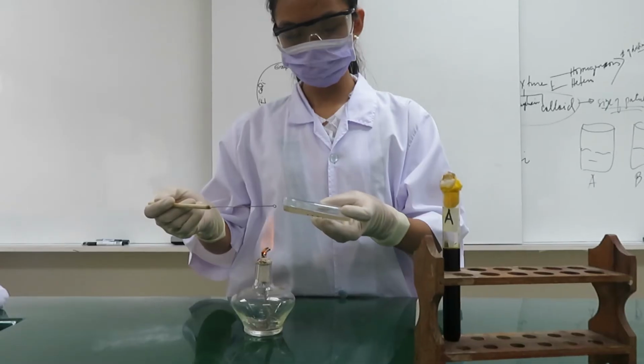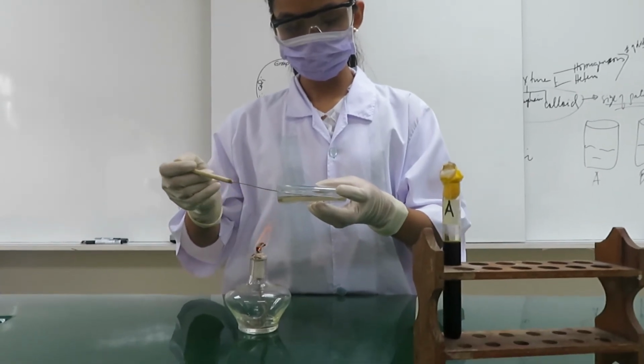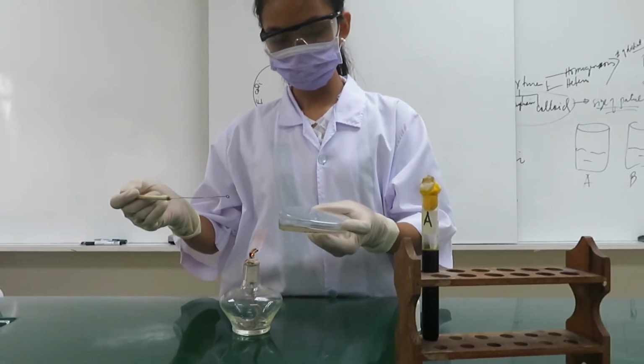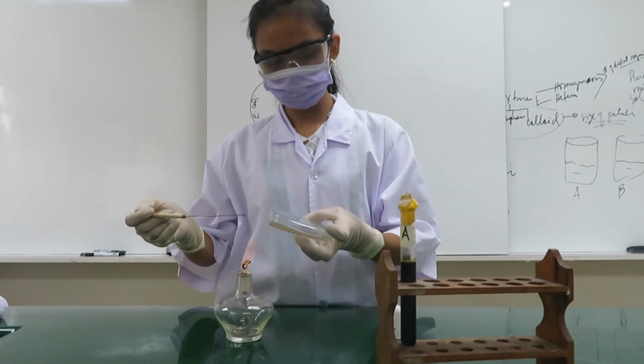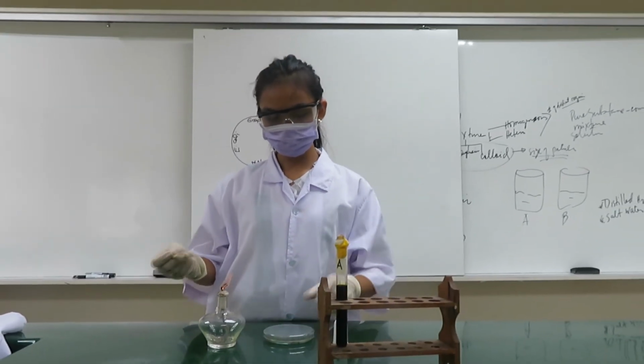6. Repeat step 5 for the third and fourth quadrants. The metal loop should always be reflamed in between each quadrant, and in streaking the fourth quadrant, avoid touching the first quadrant again.